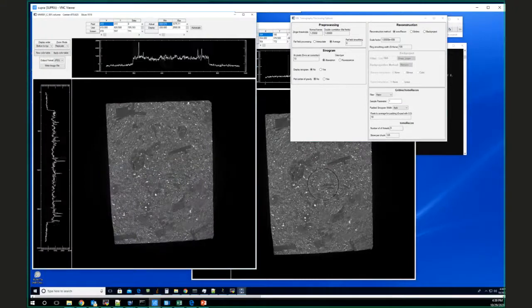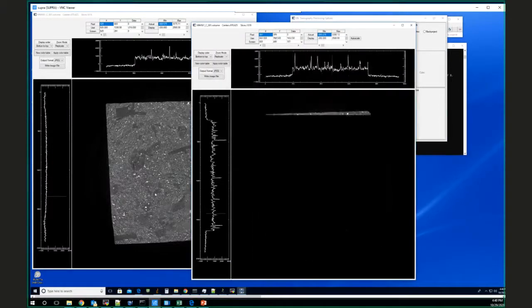And you see that ring is basically gone. And it didn't seem to introduce other significant artifacts. Had this sample, instead of being a rectangle, been a cylinder centered reasonably close to the rotation axis, the border of that cylinder would look like a giant ring artifact. And when you did the ring artifact correction, it would introduce a significant artifact into the image. But in this case, with a big smoothing like that, it looks like it's fixed this problem pretty well, at least for this slice. So let's try with that ring smoothing.